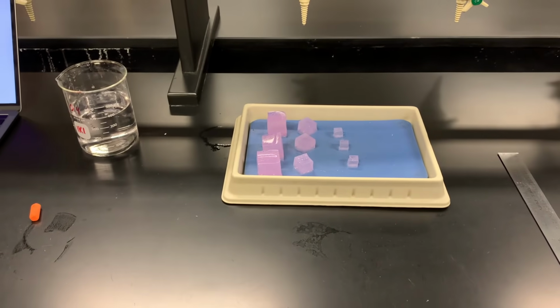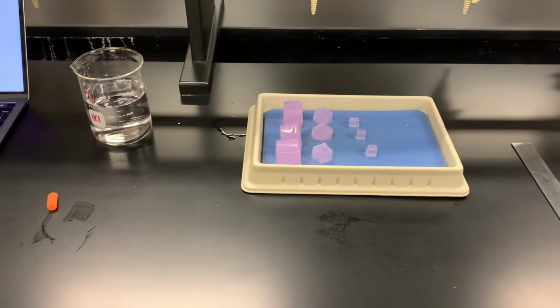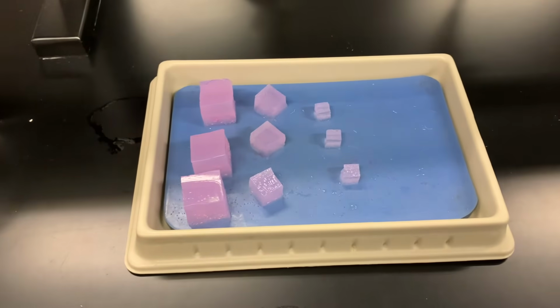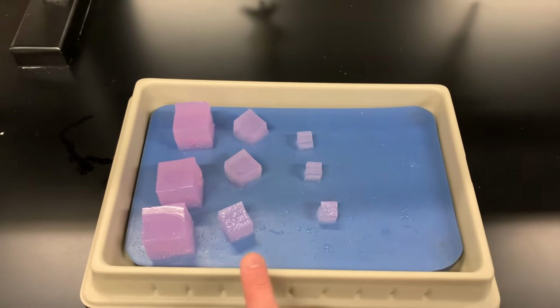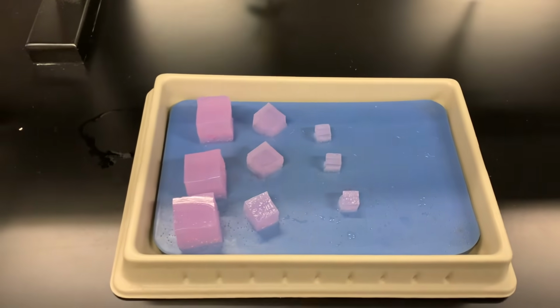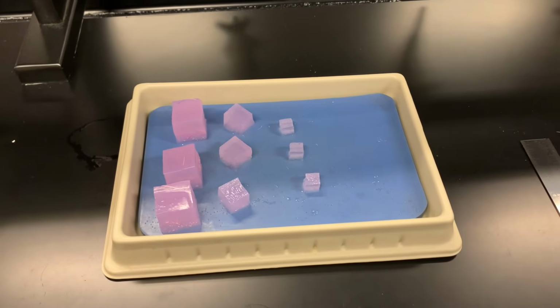Okay guys, so I set up our Diffusion Agar lab today. What I did was I made some agarose gel cubes here. I made them in different sizes. We have our 1 centimeter ones, our 2 centimeter cubes, and then lastly our 3 centimeter cubes. And each group will get 3 of each of the cubes.